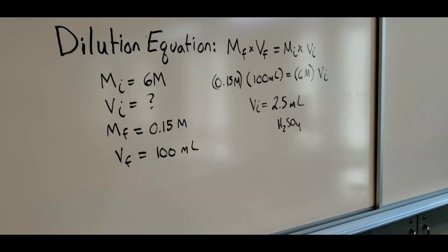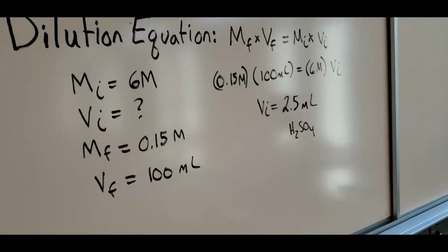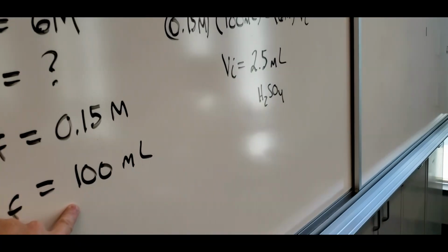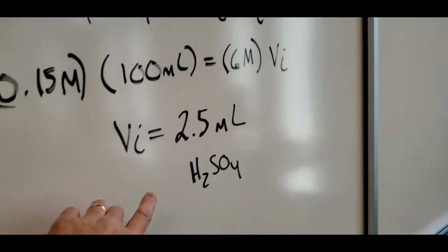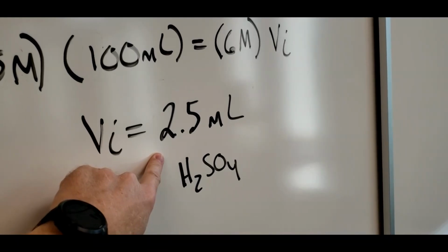Here's the calculation for the sulfuric acid. It looks almost the same as for the sodium hydroxide, but we need 0.15 molar sulfuric acid and 100 mils. It's still 6 molar for the stock solution of the sulfuric acid. We put that into the calculation and we end up with 2.5 mils of sulfuric acid that we're going to dilute.